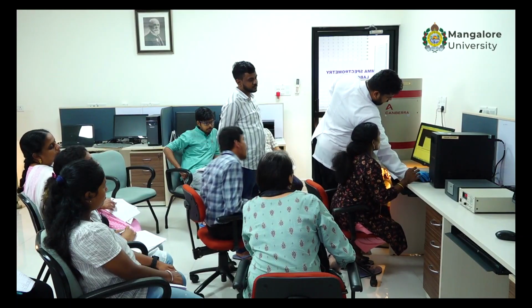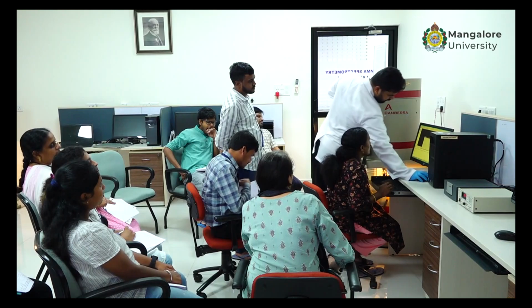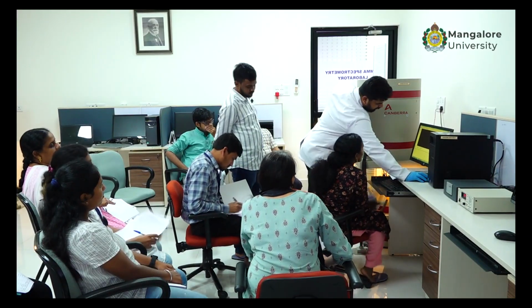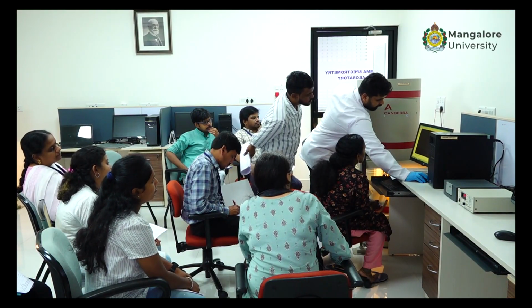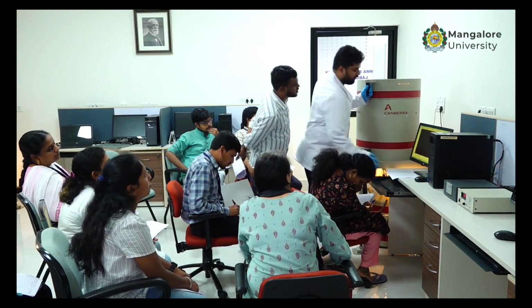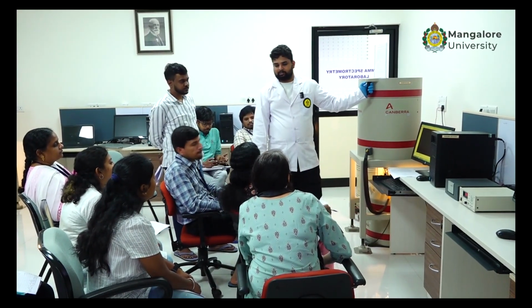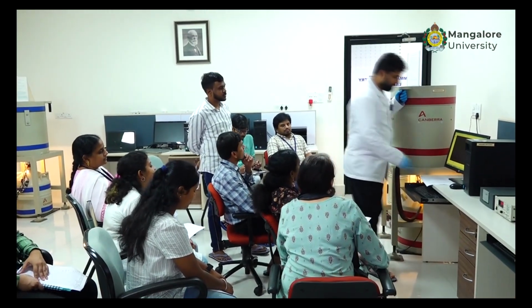MCA. We will do it for, I think, 10,000. It is not enough, but 10,000, we will do it. It has started appearing. See, this counting is pretty slow. Still, there is no peak being developed. So I think it will take at least 2 hours. We have counted, I think, 60,000 seconds. So you can see why we are giving you the already counted samples.